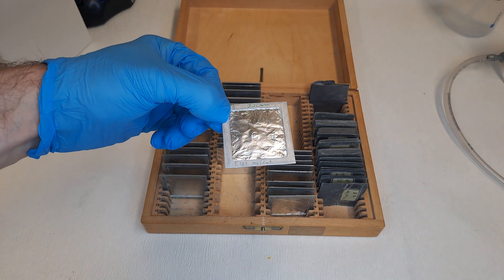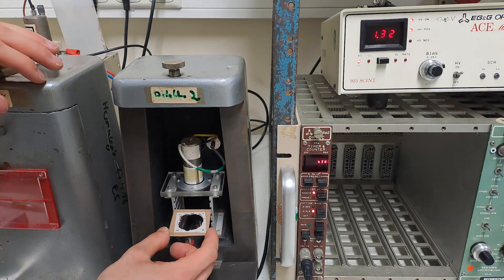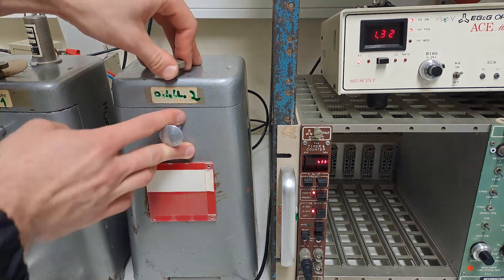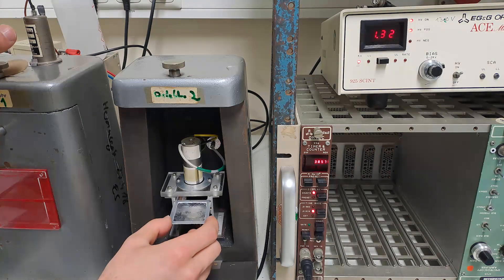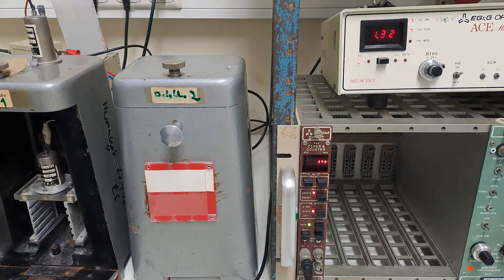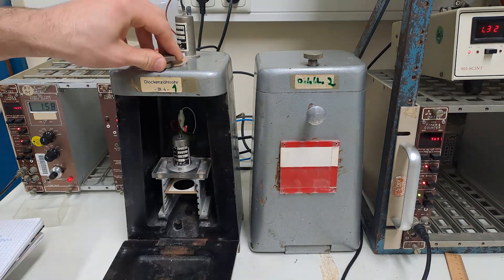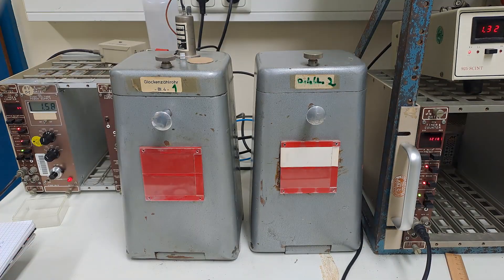Next, we'll determine the range of beta particles using aluminum foils of different thicknesses. The active site on the source is placed in the second slot and a new aluminum foil is added on top of it for each measurement, taken over two minutes. After adding the second foil, I realized I had another detector available, so I measured phosphorus-32 on the right and thallium-204 on the left simultaneously.